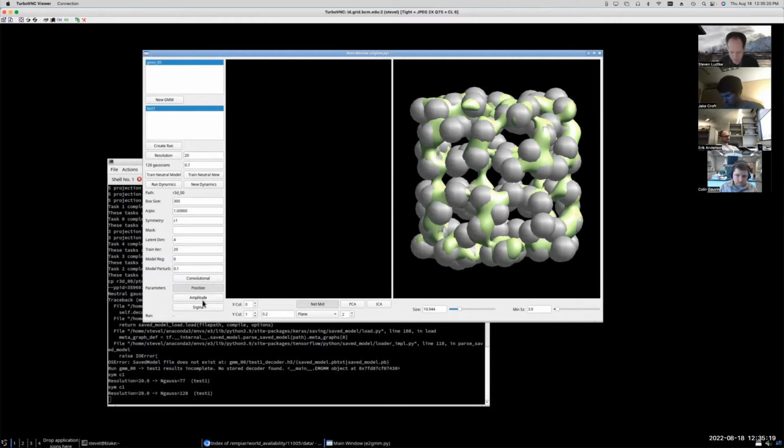And then you have to pick whether you want to allow the position, the amplitude, or the width of the Gaussians to vary. Like I said, I've gotten rid of width in some of the newer things, so that eventually is going to go away. We'll go ahead and let both position and amplitude vary here. If you want to detect this missing subunit, that should come through as an amplitude variation. If you turn off amplitude, then it will try to deal with any missing subunits by taking the Gaussians in that space and pushing them off to the side or something like that. If we give it the freedom to alter the amplitude, then hopefully it would take care of it that way.